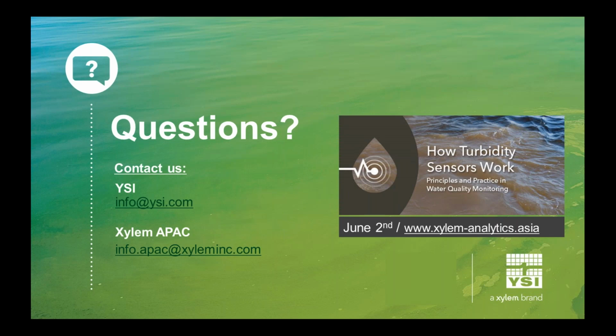Now, the last thing I'll mention, and I'm not sure if this might be what the person asking the question means, is you might test your power at your site. So sometimes high winds are going to cause interruptions in data simply due to power. So if that is the type of thing you're seeing, where all of a sudden your data are dropping off and then returning, that would probably be a power issue, Michael.